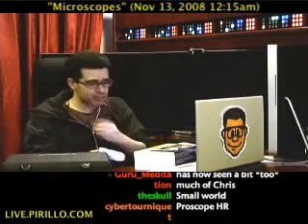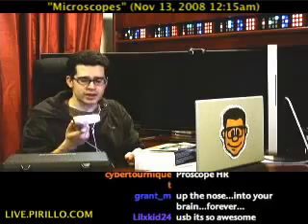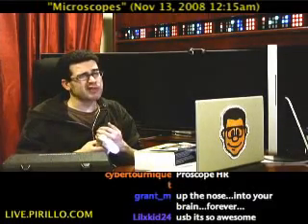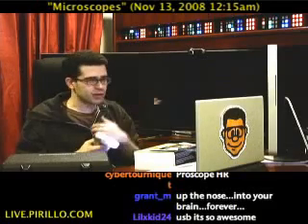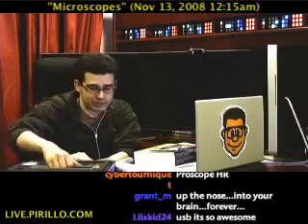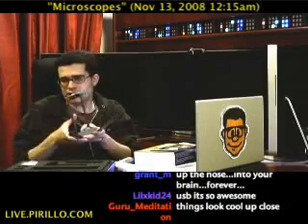Two thumbs up — or a thumb that I can zoom in on really close. There's my thumb print, right there. What's neat about the software is that I can press a button on the ProScope and it'll take a still picture of whatever it is that I happen to be over. I can take it at 320x240, 640x480, or 1280x1024 if memory serves. I can also record video, and if you have a kit like I do — I got it years ago — there is a way for you to mount the ProScope and take a time-lapse. With the software, you can take time-lapse photography of anything you happen to be zoomed in on.